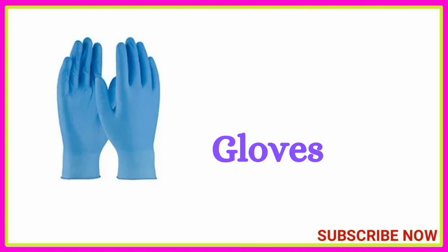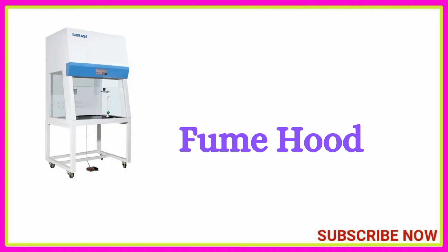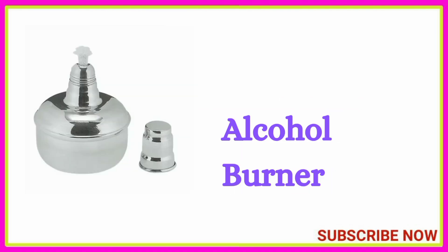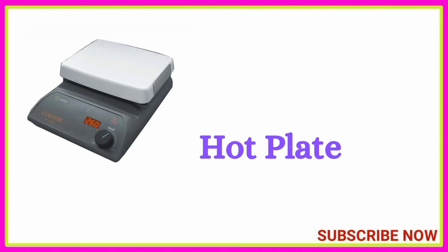Safety equipment: lab coat, gloves, face mask, fume hood. Chemistry laboratory equipment: Bunsen burner, alcohol burner, hot plate.